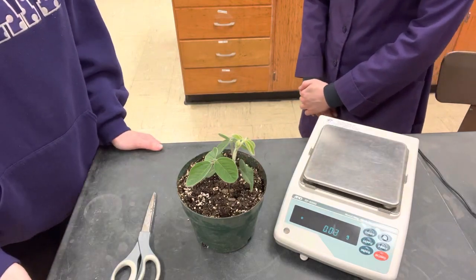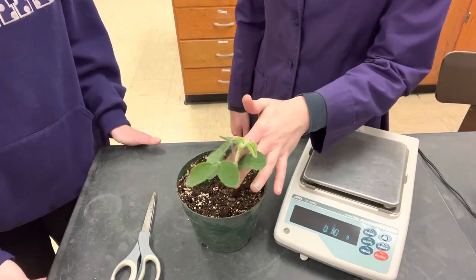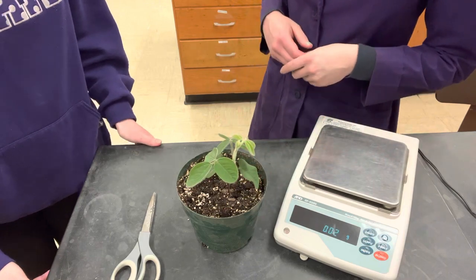Hello, this is a video on how to measure the biomass of your soybean plant for the Willie and the Beanstalk competition.